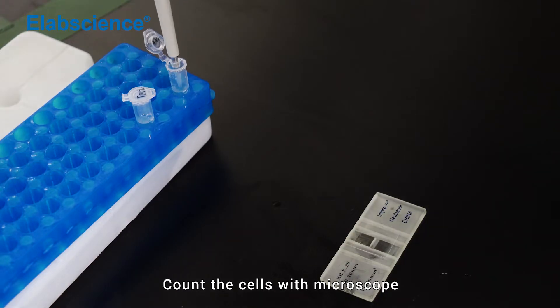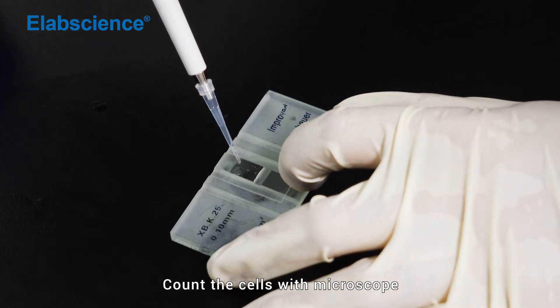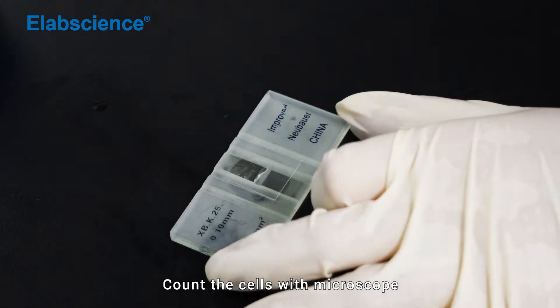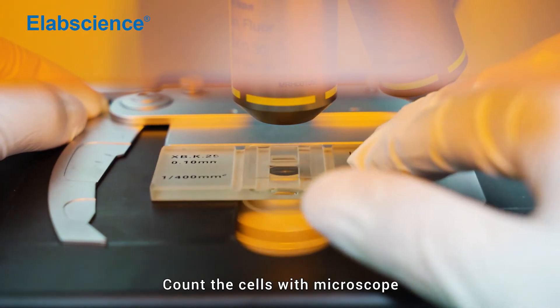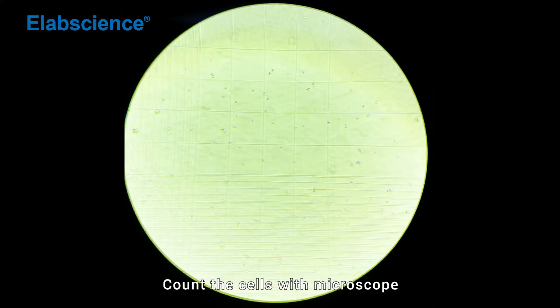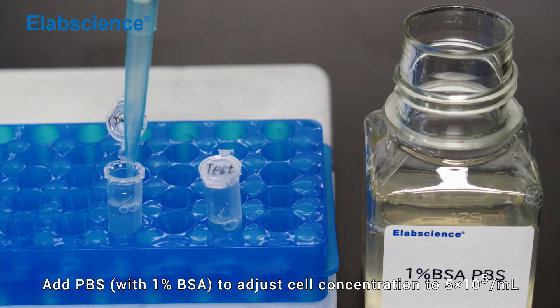Count the cells with a microscope. Add PBS to adjust the cell concentration to 5×10⁵ cells per mL.